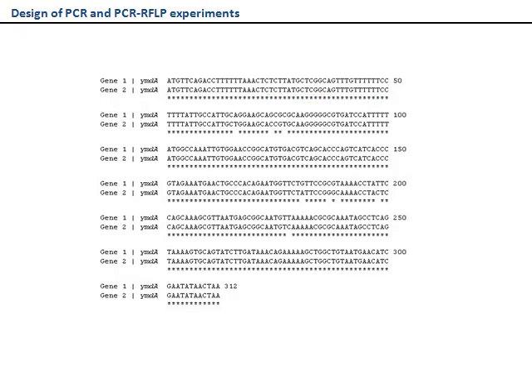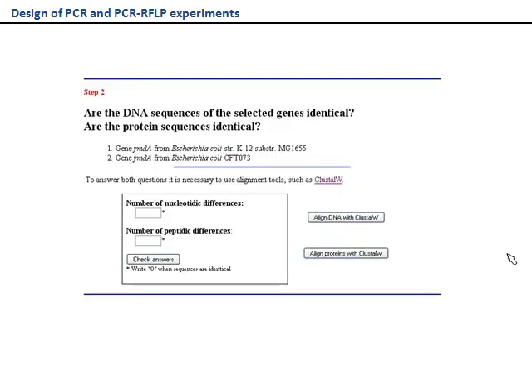When nucleotides in both sequences are not identical, as for example in the 8 positions shown in the image, the asterisks are absent. To facilitate the counting of differences between sequences, the service shows the number of differences in the bottom of the alignment. In this example, the number of differences to be recorded is 8.